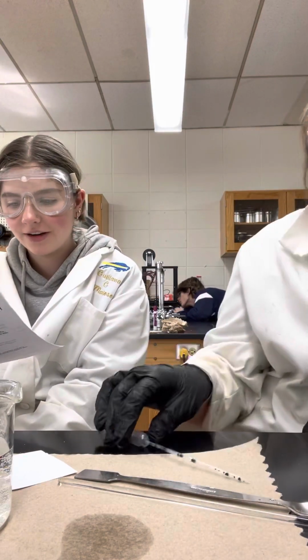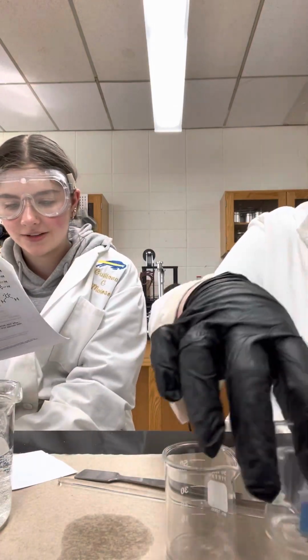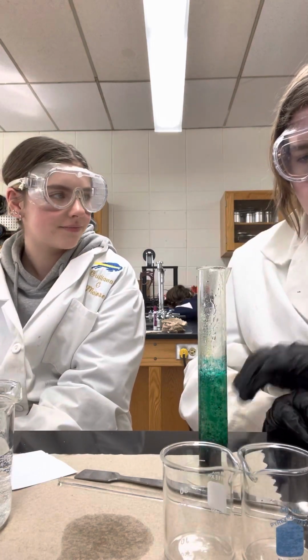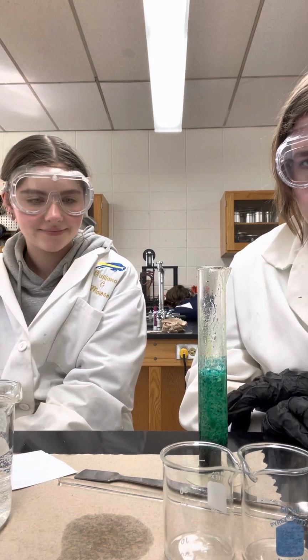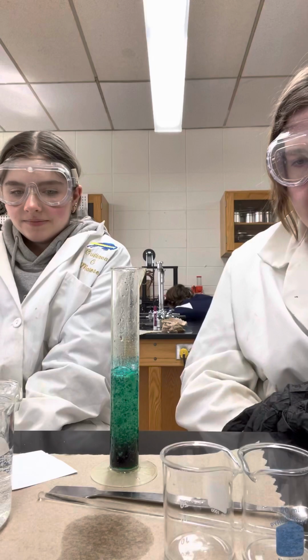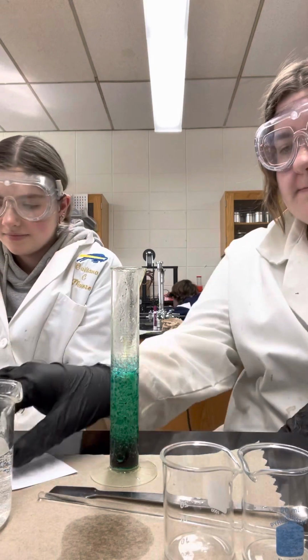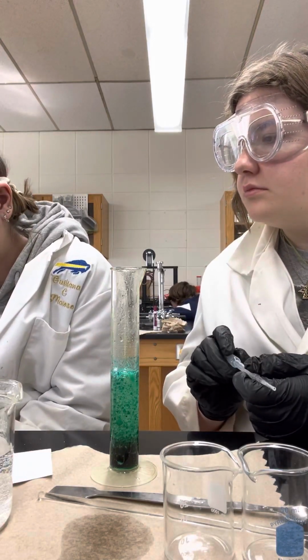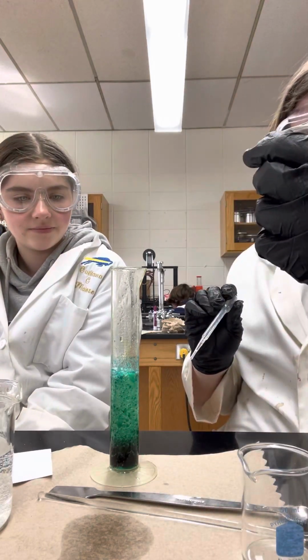Perform. Wait for the reaction from part 1 to end and the mixture to settle. Use a dropper to transfer the oil into a 50 milliliter beaker. Now we wait. Use the dropper to transfer the oil into a 50 milliliter beaker. Olive oil.